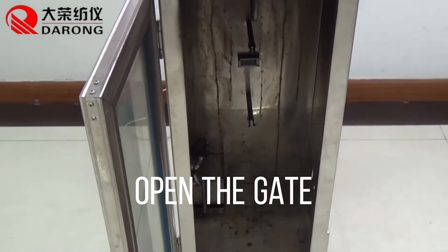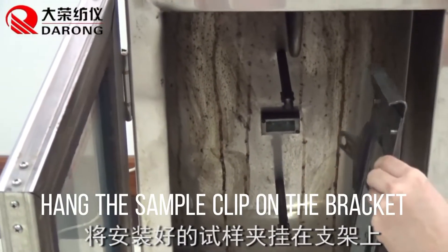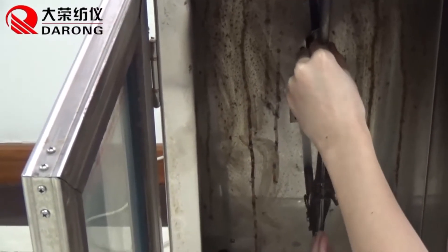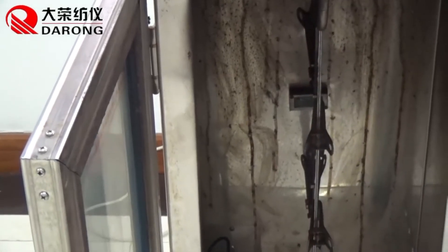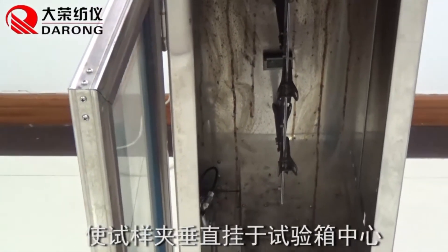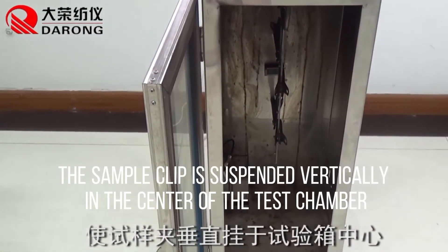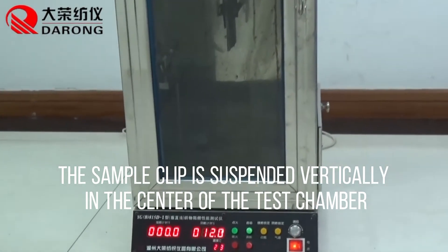Open the gate and place the sample clip on the bracket. The sample clip is suspended vertically in the center of the test chamber.